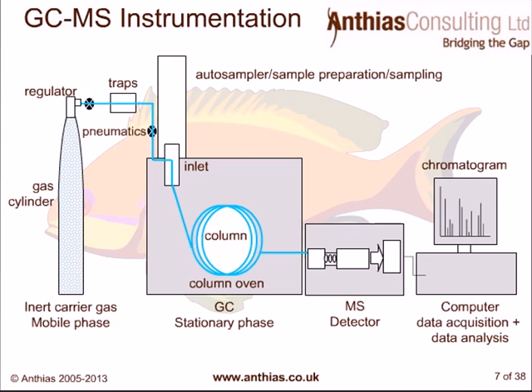So as I mentioned, when we do choose our carrier gas, we think about keeping that purity, because especially if we have a very, very sensitive instrument set up, we want to buy our very high purity of gas, and we want to maintain that purity into the instrument.